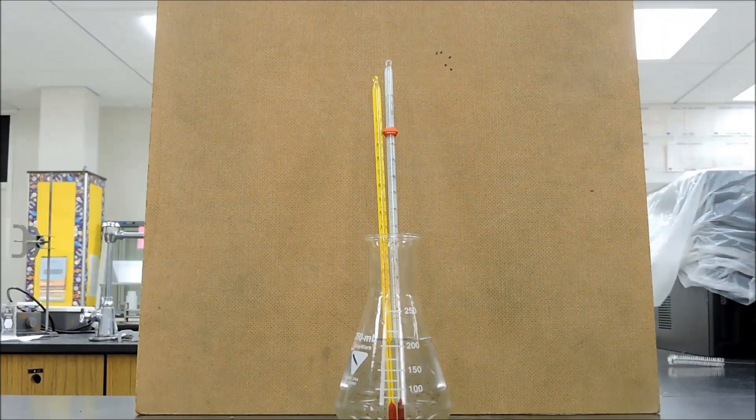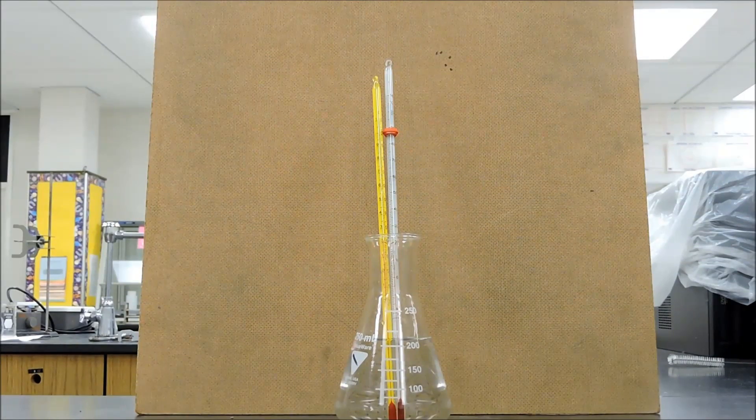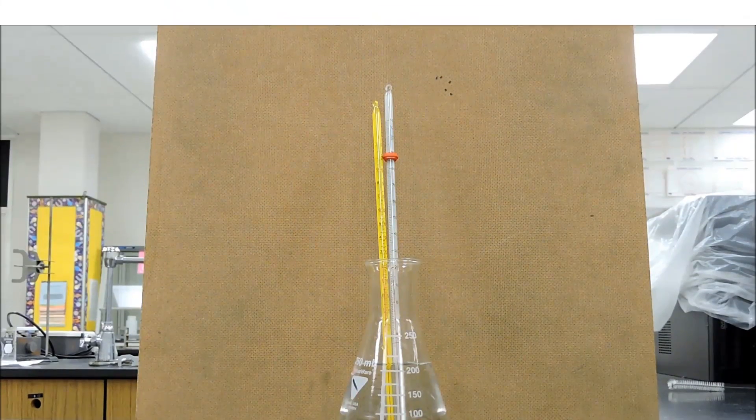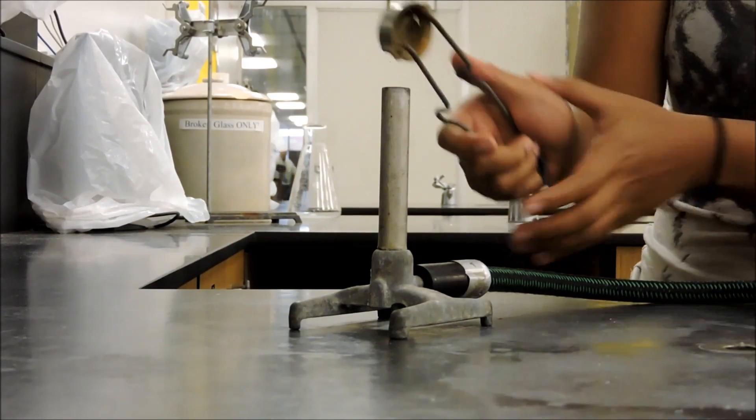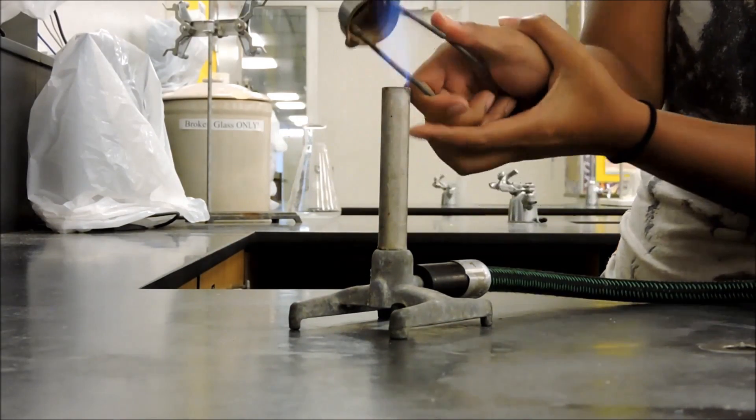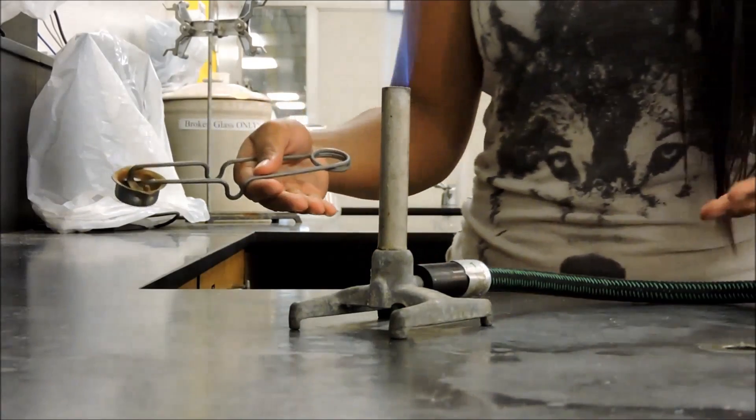These are thermometers. They are used to measure temperature. Thermometers will be mainly used in the calorimetry lab. The striker is used to light the Bunsen burner. A Bunsen burner is used to heat up items.